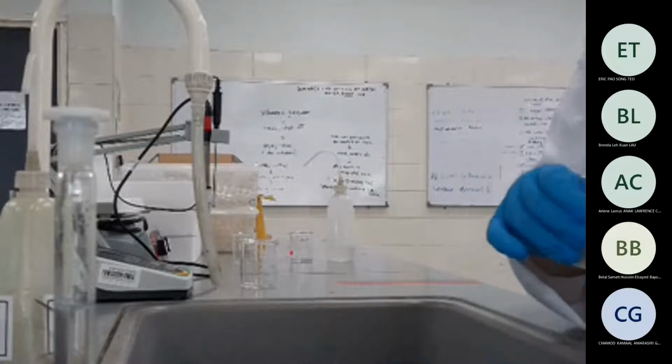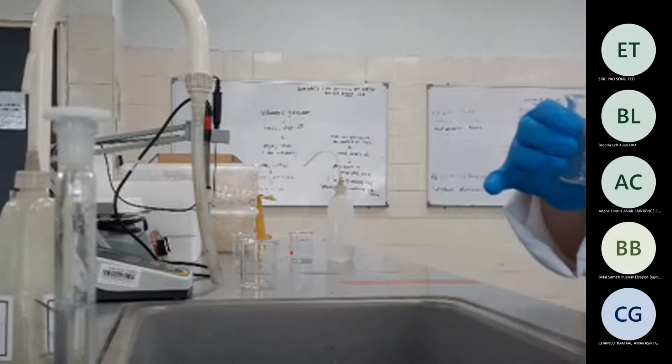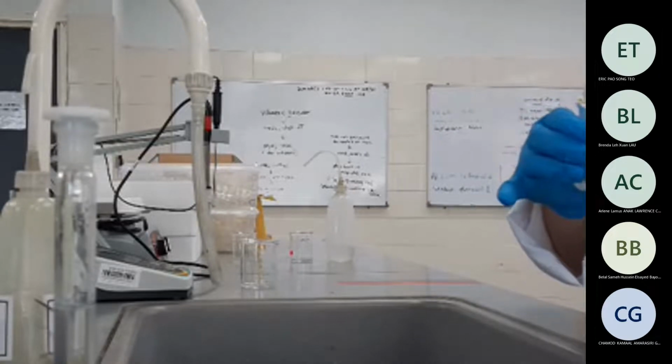First of all, rinse it a little bit, discard it, and then take the solution. Okay, so both of you have done, Vanessa and Noor, the first part, so you can proceed to the second part now.